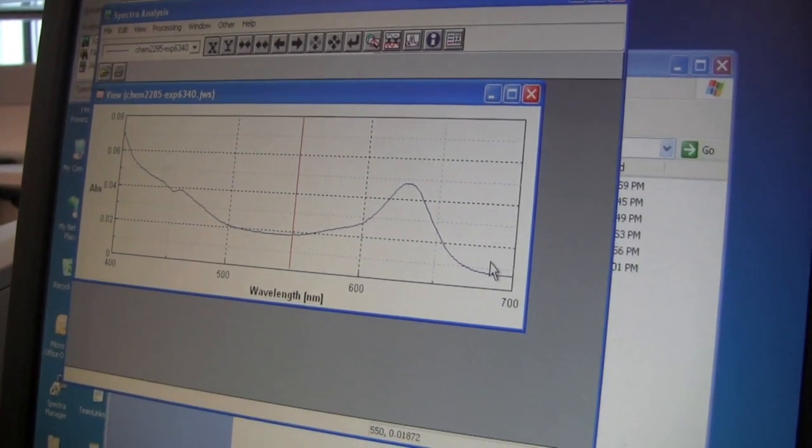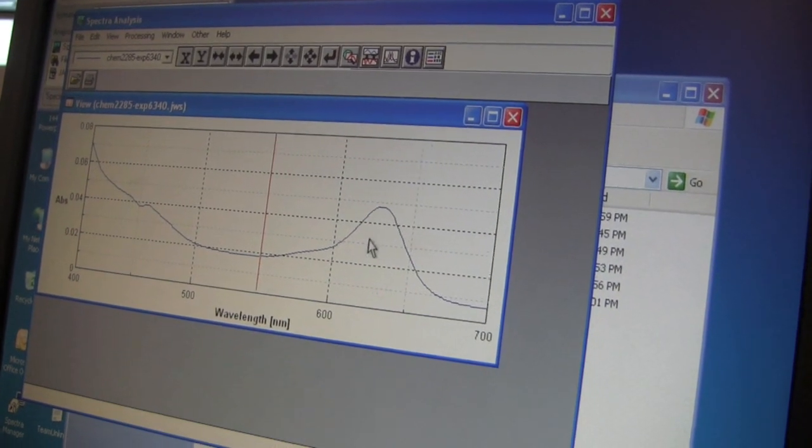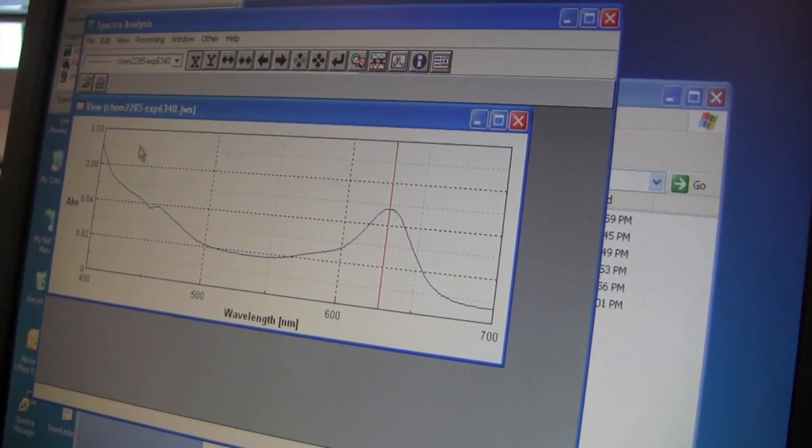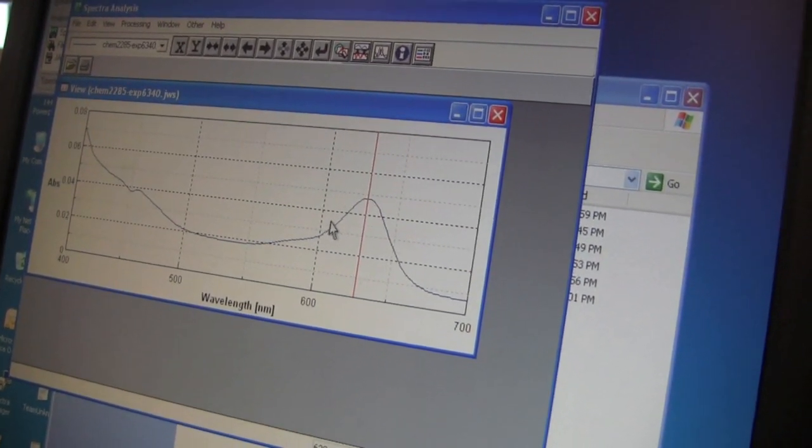When it's finished, you want to find the highest point on the graph. Since this graph was of food coloring, it will look different than the graph of yours. This one has two peaks, yours should only have one.